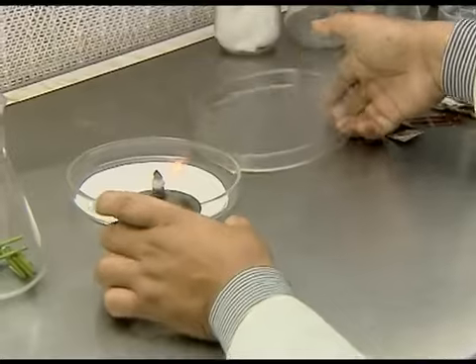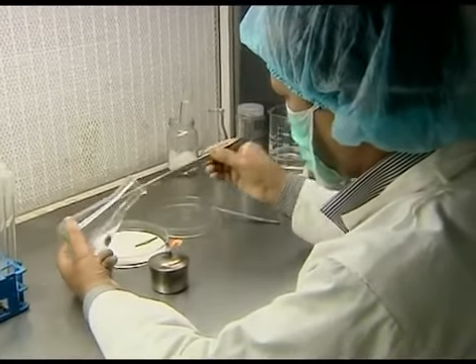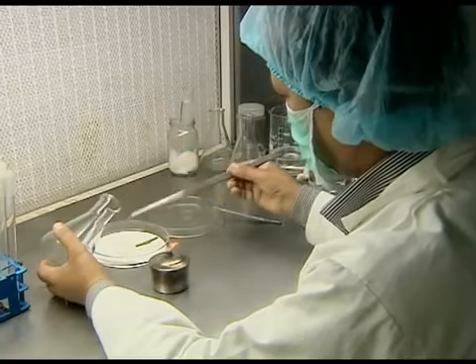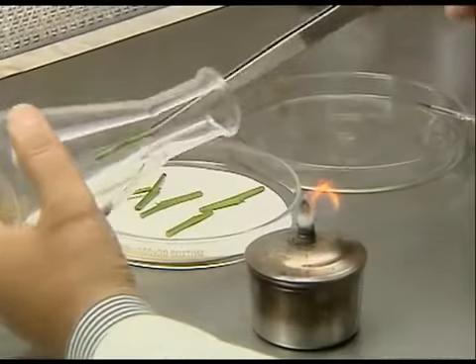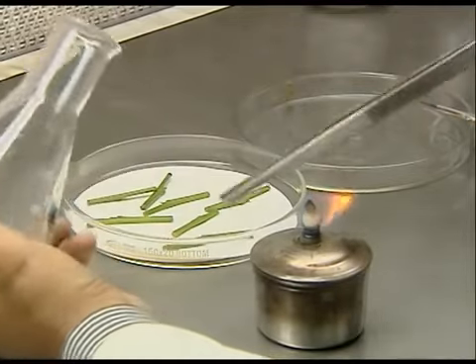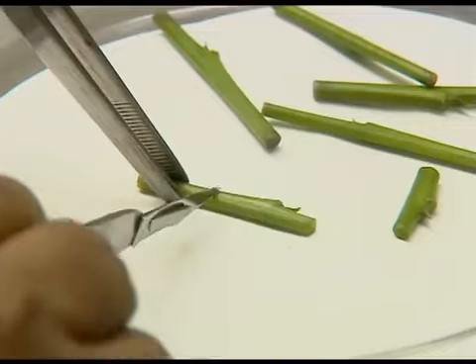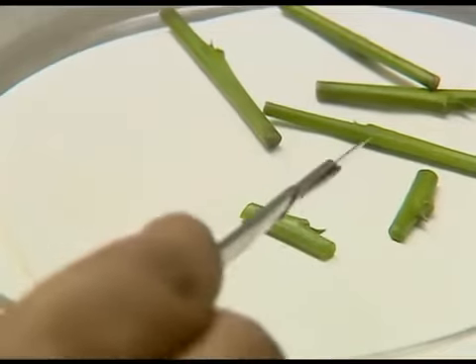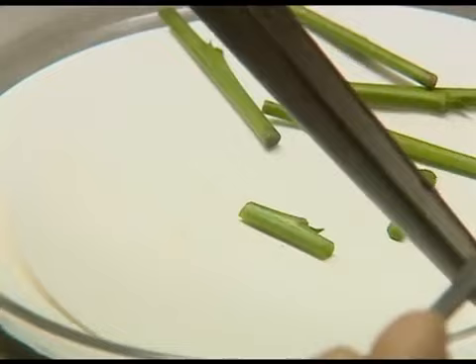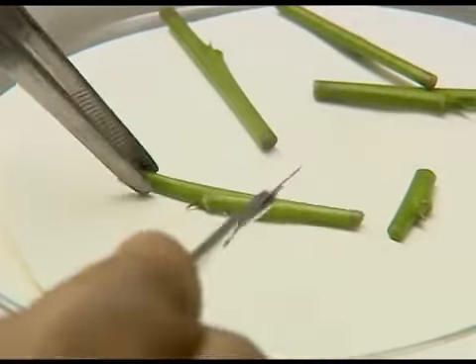Now, after cooling the forceps, the explants are carefully picked and placed in the Petri plate with filter paper so that all the excess water content will be absorbed. Surface of the explants, which were exposed to mercuric chloride, are removed with the help of a surgical blade.